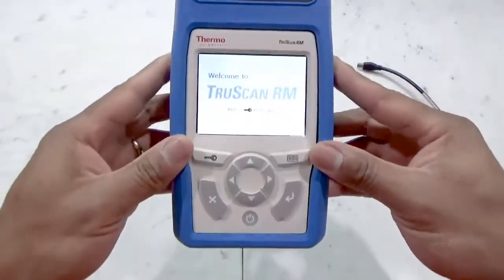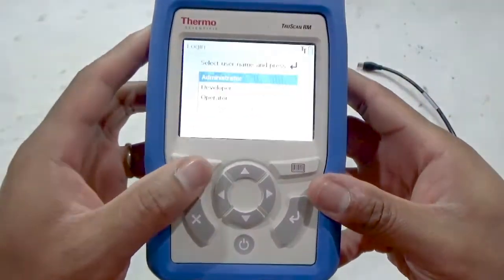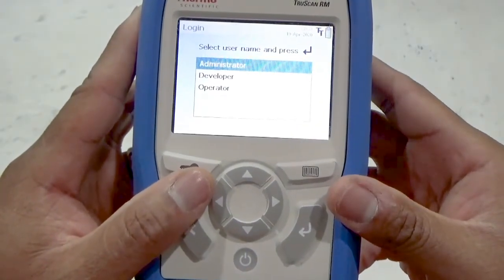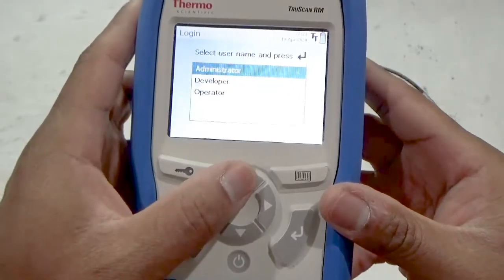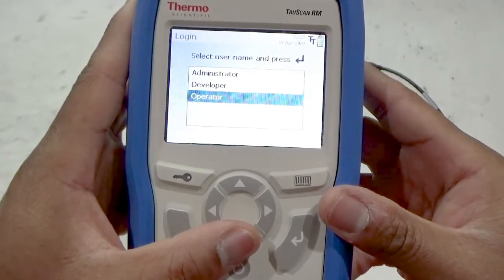When the instrument is at the login screen, press the login button to access the list of approved users on the instrument. The system administrator can enable the strong passwords requirement for enhanced security. There are three user access level types: administrator, developer, and operator, each with specific capabilities.